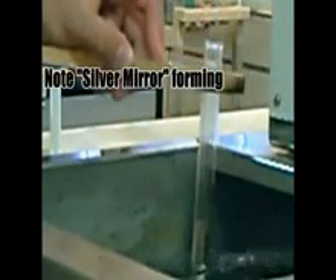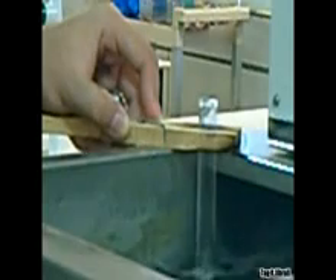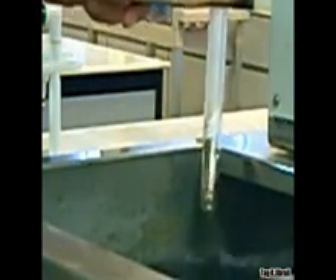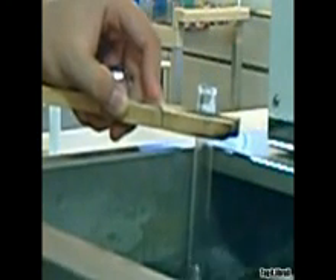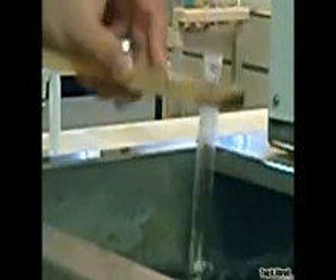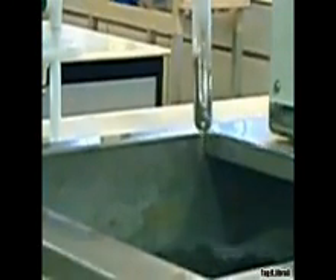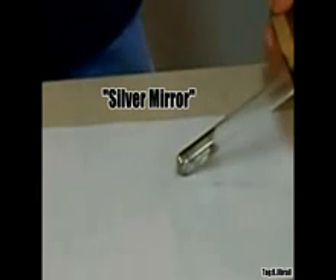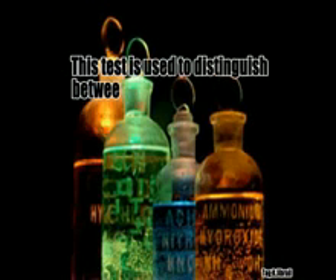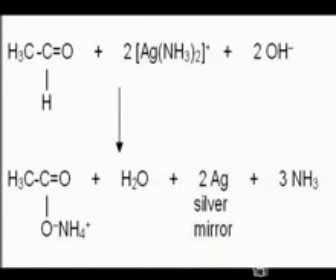Note the silver mirror forming. The silver mirror is a reflective lining around the test tube. It is caused by a deposit from the reaction in the test tube. It is used to distinguish between aldehyde and ketone — only aldehydes can undergo the reaction and deposit silver. This is the reaction.